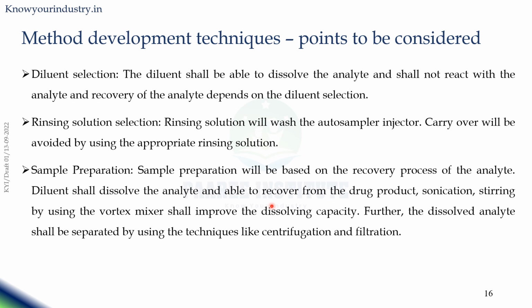Then finally, you centrifuge or filter the sample so that you are completely separating the analyte from the sample matrix. So these kinds of steps will be optimized during the sample preparation procedure, and this is part of the method development in a liquid chromatography technique.